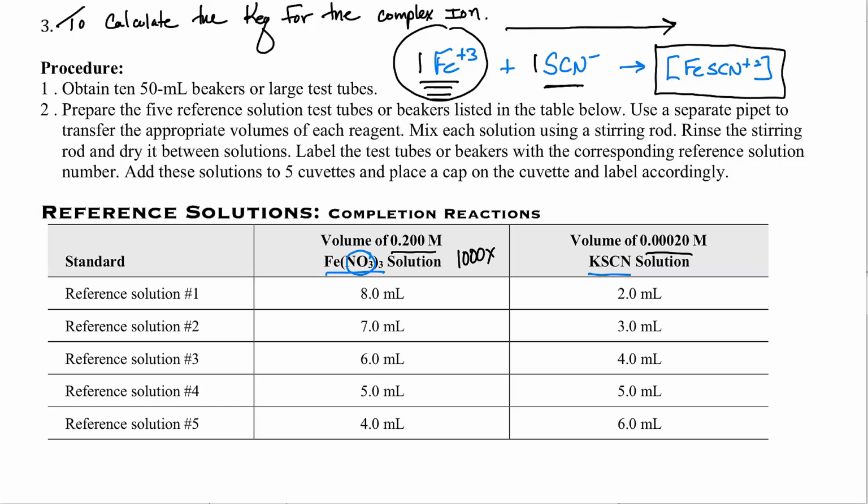Now, the Beer's law graph is very simple in the idea that the absorbance, A, that's how much light is absorbed or goes missing in the detector, is going to go up as the solutions get more concentrated. But we have to know the molarities. So we're going to tell the computer, as I've already done for you, what those concentrations are and plot them. The computer's going to measure the absorbance, and we're going to write the concentrations, and we're going to get this linear line with a best fit.